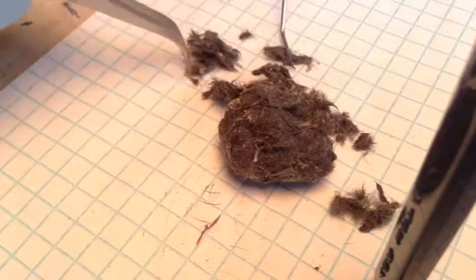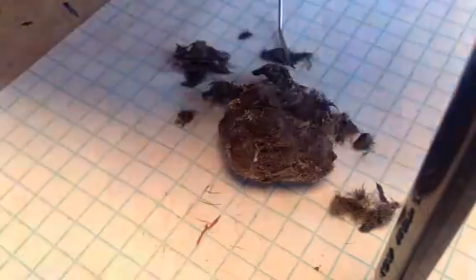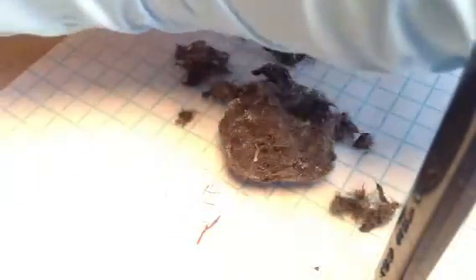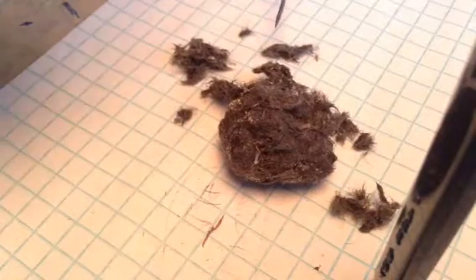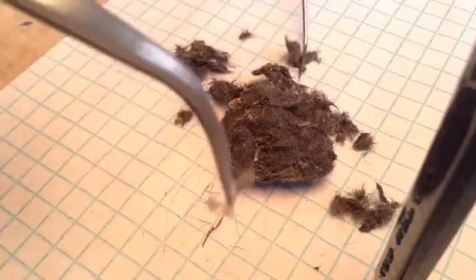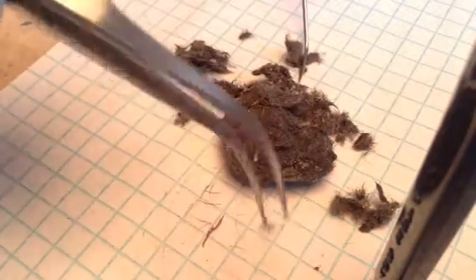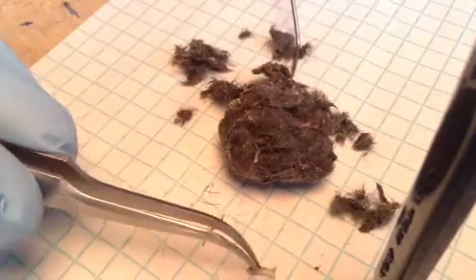Looks like we got a little arm bone right there. Foot bone. Can't quite identify it — not yet, at least. Might even be a little toe bone. Surprisingly enough.